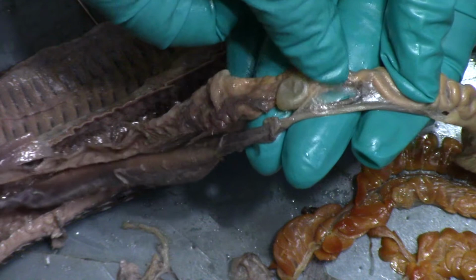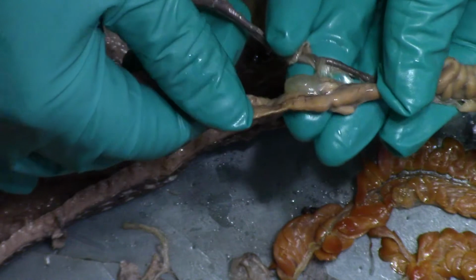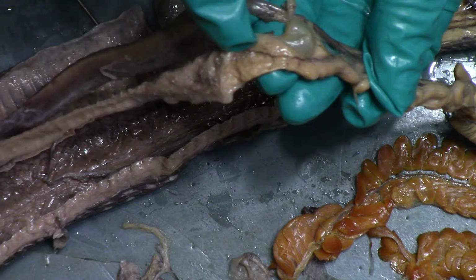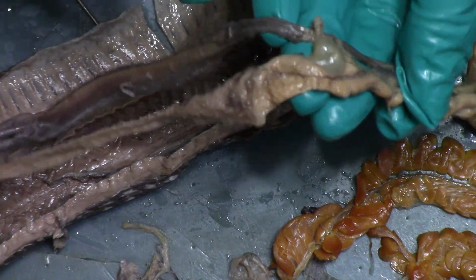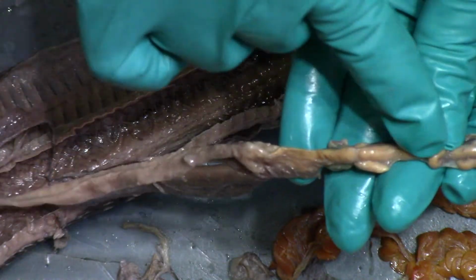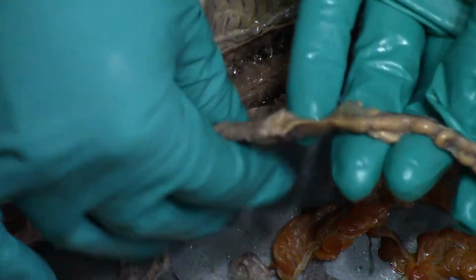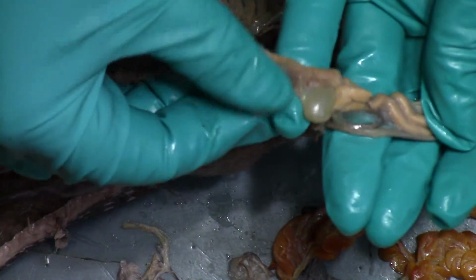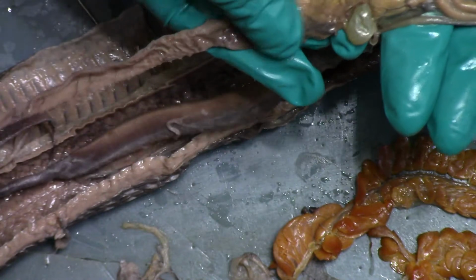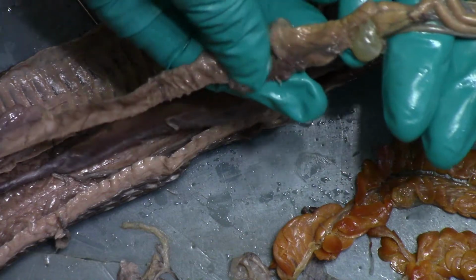I think that this is the spleen, and that the pancreas is this organ here above, anterior to the gallbladder, because I think that is the main small intestine. So this might be the pancreas, but I'm really, really bad at finding pancreases. They're long and thin. I can feel the texture is different from the esophagus to the stomach. The esophagus has a very smooth muscle feeling. The stomach has some ridging.